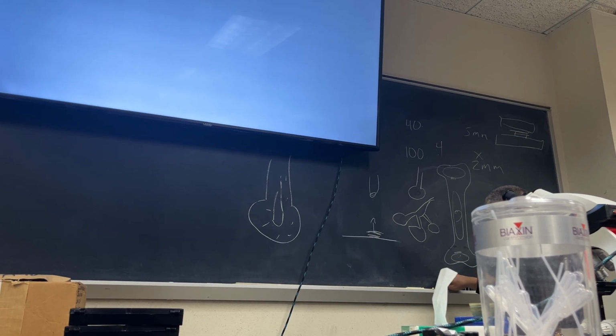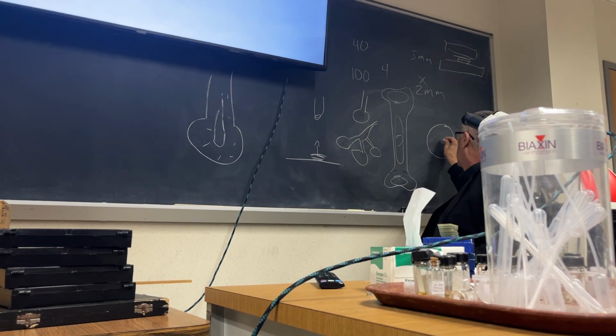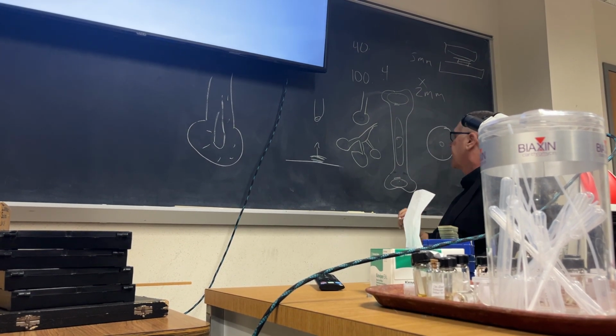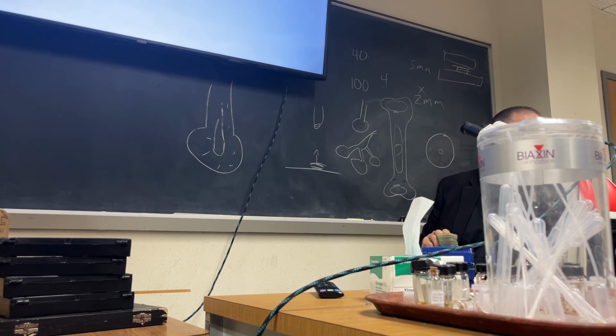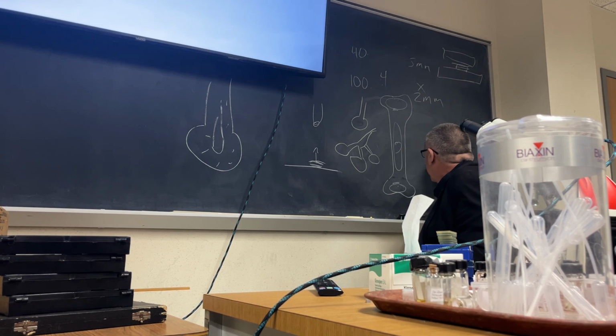All right, let's see. The picture you were talking about is the nerve slide, right? Cross section. So what you have is a cross-cut axon of a nerve, and it usually looks kind of like that. Where's the axon itself? In the middle, that little thing in the middle. This is all myelin here.